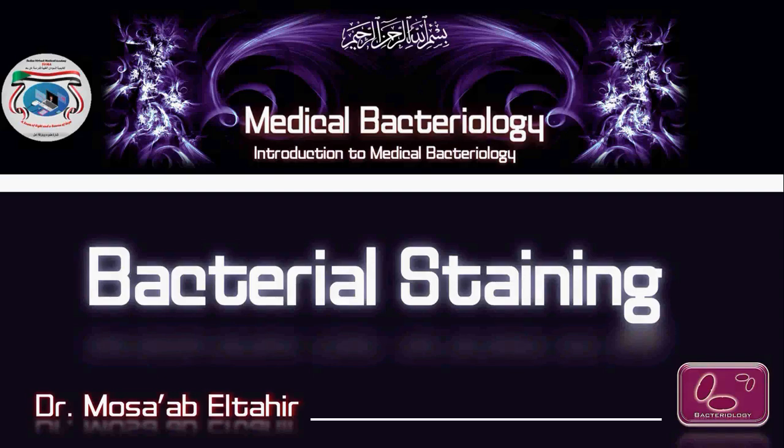Okay, this is just a small practical session with regard to bacterial staining.